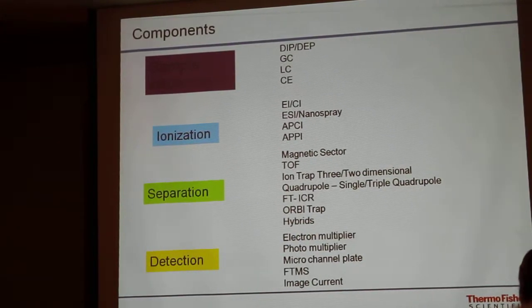Ask me sometime, I'll tell you the history behind that. But it has to do with the violation of patents and finding a way around it. Microchannel plates are kind of like multiple electron multipliers stacked together, and that's what's used in time-of-flight detection systems.